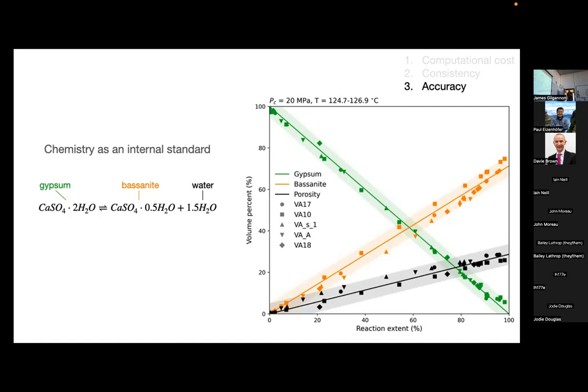And because you know that and you know the volume, this can be useful because you guys have a speed system that's been set up. You could scan a metamorphic rock. You don't need a time series. And if you've identified your reactions, you can plot something like this, a classical reaction progress type diagram, and you can test if you did a good job of segmenting your data. Because realistically, your reactants and your products should lie very close to that line.